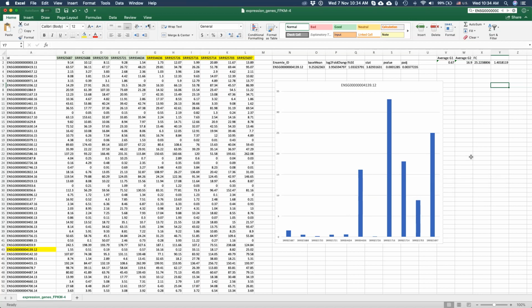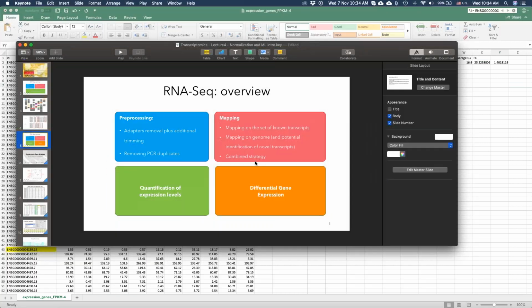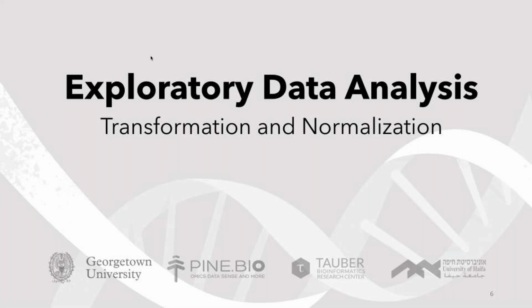And so I might be accounting for various technical variations that I do not understand. So if we go back to the presentation, I want to talk to you about transformation and normalization as a step before the actual analysis.